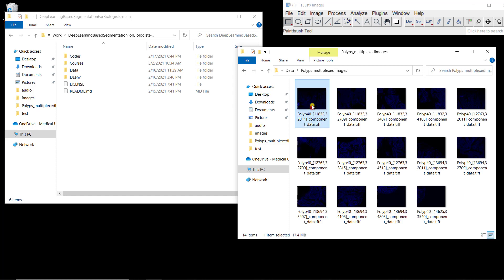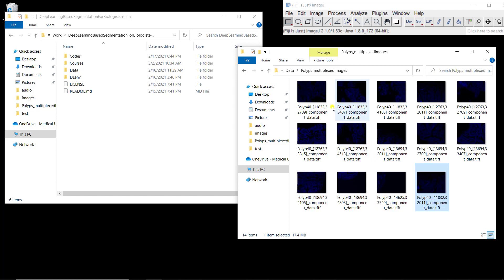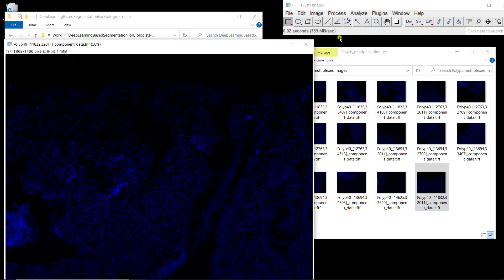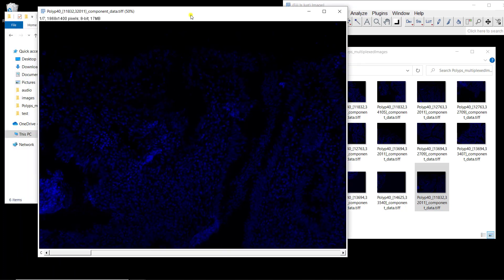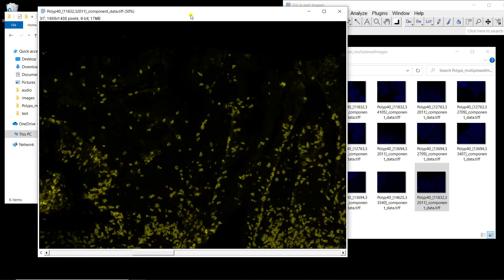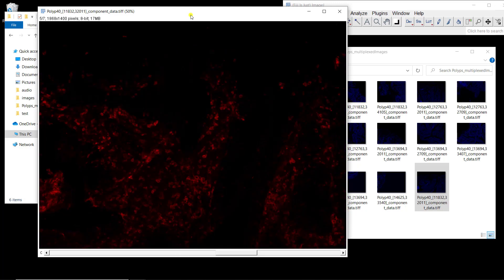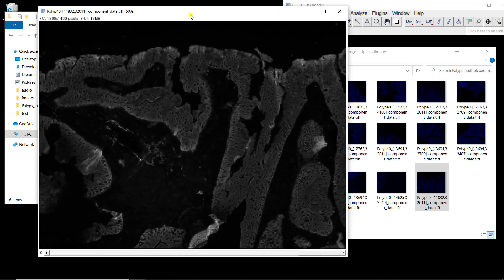Let's open the first one. It's an image with seven channels. The first one is DAPI, the second one corresponds to T-bet, third one CD8, fourth one ROR-gamma-T, fifth one CD4, then FOXP3, and finally cytokeratin.